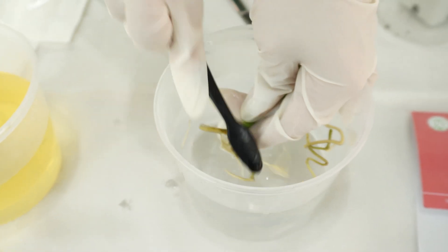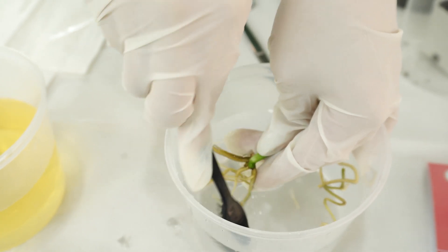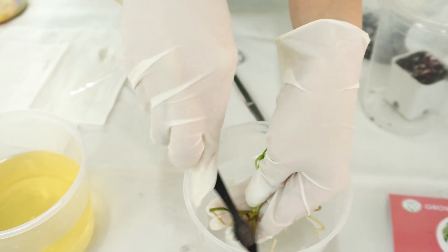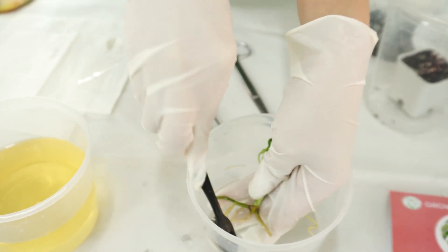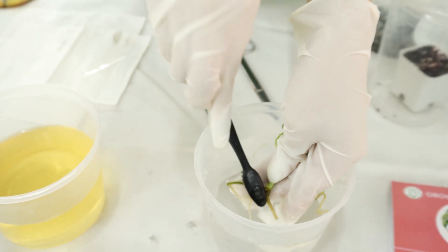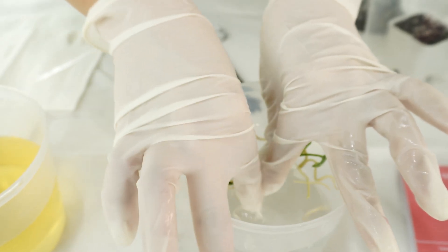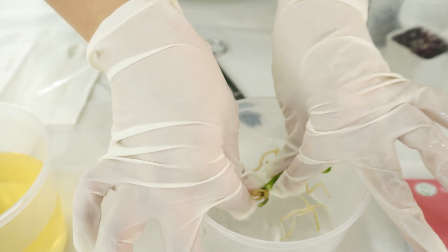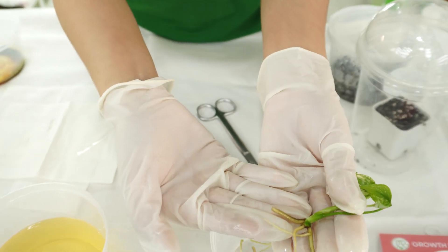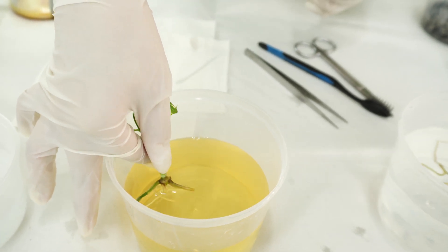Now we clean the plants with water, using the brush. Make sure that you don't have any agar or gel left on the plant or the roots, because those things are going to cause the plant to get root rot or stem rot. Make sure that you clean them thoroughly.